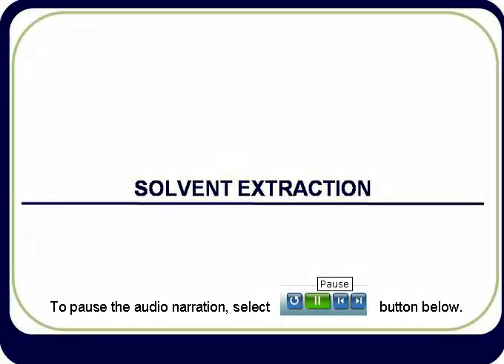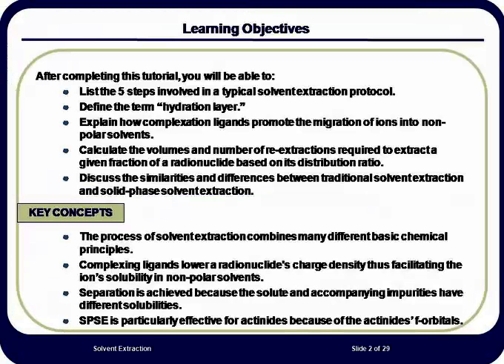This tutorial describes the process of solvent extraction as it is used in the analysis of several different radionuclides. When this module is completed, you should be able to list the 5 steps involved in a typical solvent extraction protocol. Define the term hydration layer.